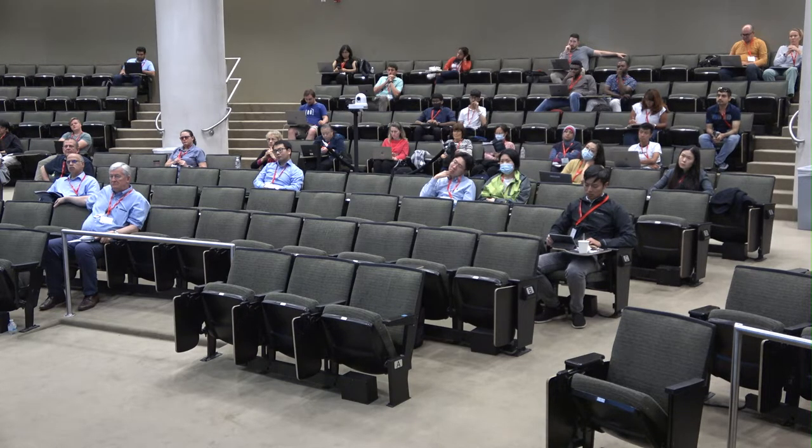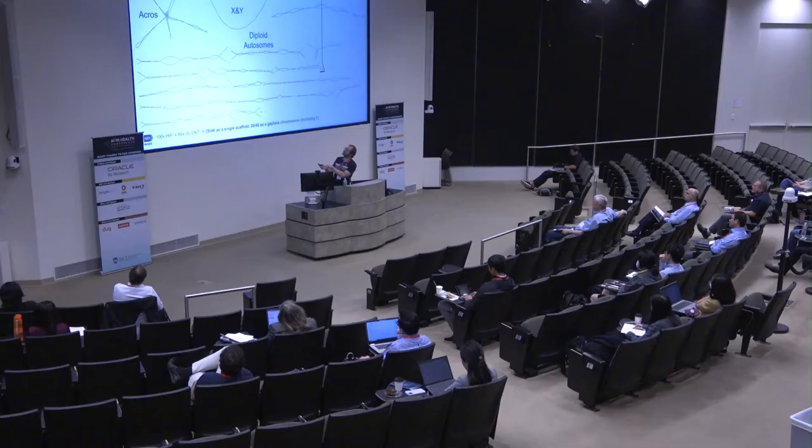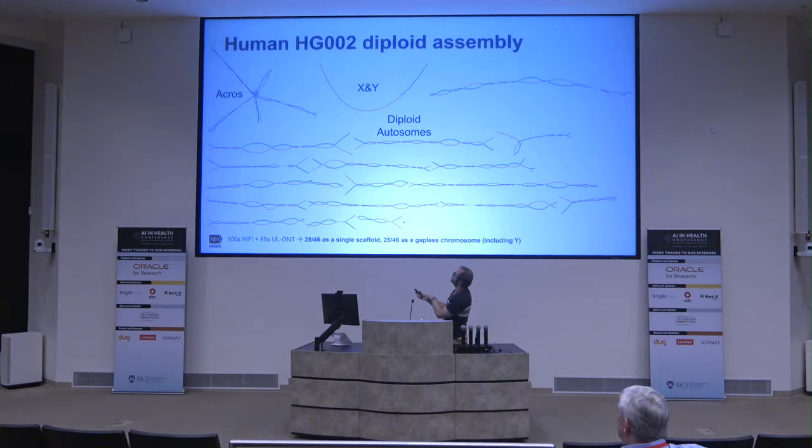So what this chromosome actually looks like is there's a long, relatively easy to resolve long arm. Then it goes into this big, messy rDNA, where it repeats the 50 kilobase rDNA repeat multiple times, hundreds of times often. And then it has a little short piece that goes on the other end of that array. And so there are two problems you have to solve here. One is we have to pair this little bit to the appropriate one, whether it goes with this or this or this or this. And then there's also how do we represent the rDNA array in the middle. And the way we did that for the manual finished human genome was we identified chromosome-specific versions of the rDNA array and filled that in.